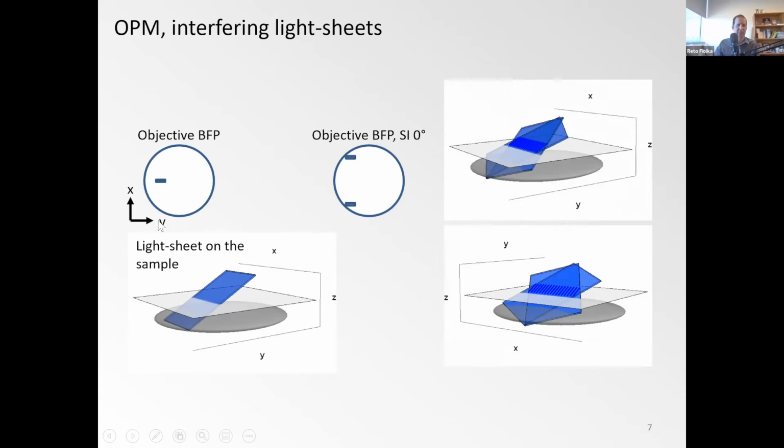Well, you can relabel this as kx and ky for the spatial frequency coordinates. So they have the same offset to the center in ky, but have an additional offset in kx. So they will both lie in the same tilted plane, but are angled to each other and create that fringe spacing. By the way, here you can also see why that relative opening angle is limited, because you're already somewhere at the periphery of the pupil. If you were in the center, you could shift them a bit further out.